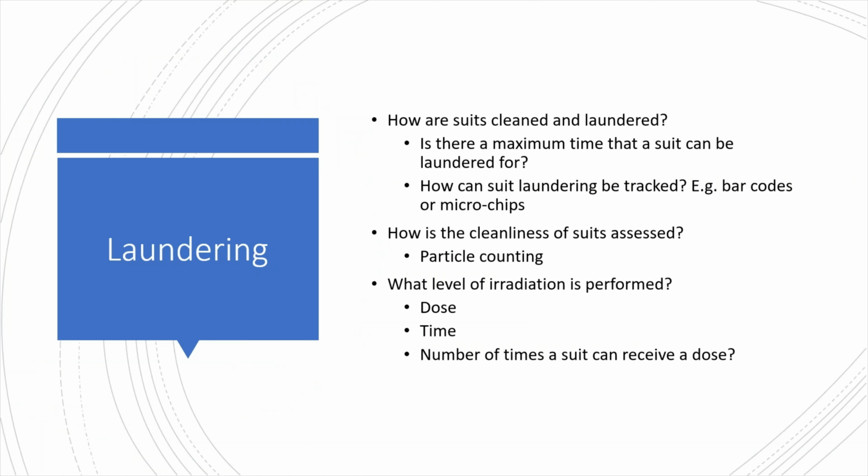Now, with relaundered gowns, things such as repairs and laundering are important. And here we need to consider, how are suits cleaned and laundered? So here, anybody purchasing or dealing with gowns that are relaundered, it's very important for both production staff and for microbiologists to have audited the gown provider.